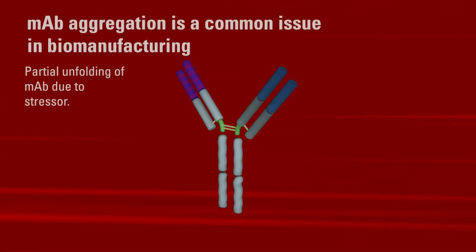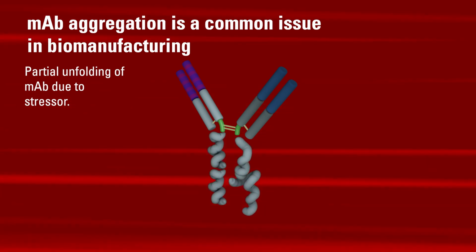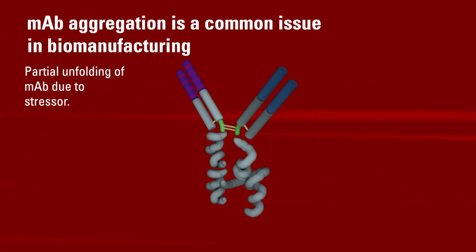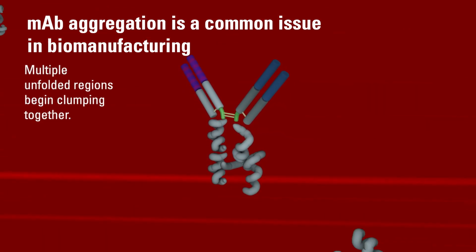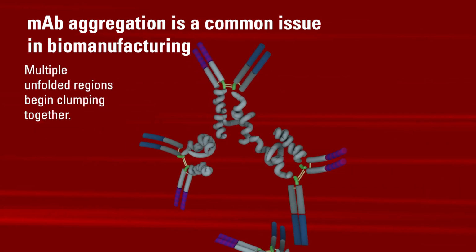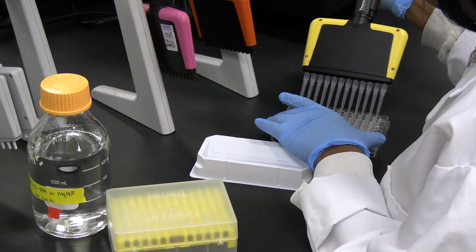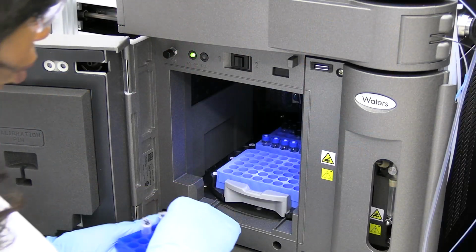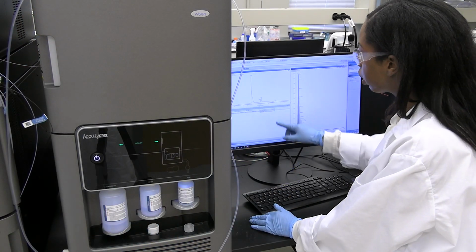The formation of protein aggregates during monoclonal antibody production is a very good example of an issue that is influenced by the bioproduction process. This results in not only product loss, but also affects product safety. So just from the inherent complexity of manufacturing biologics, we really need analytical methods that can thoroughly characterize a drug product to help mitigate some of these issues that arise during bioprocessing.